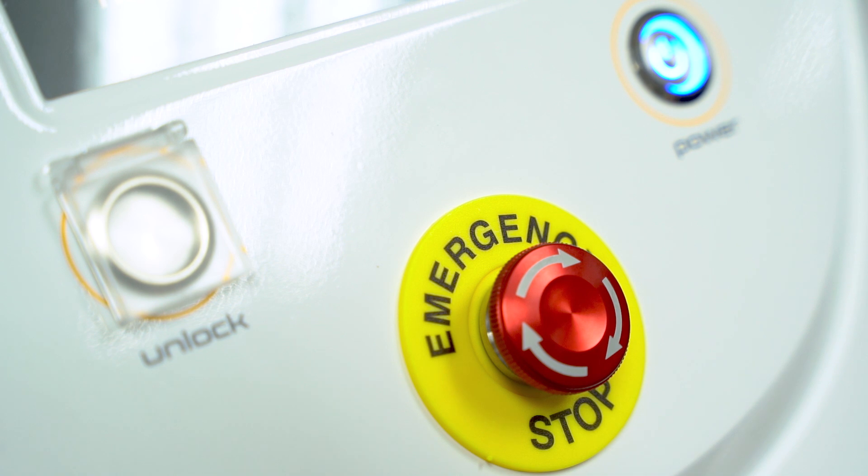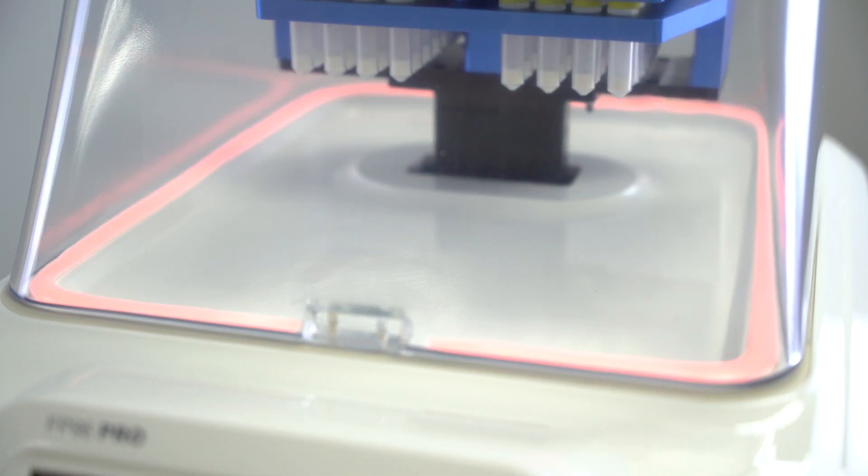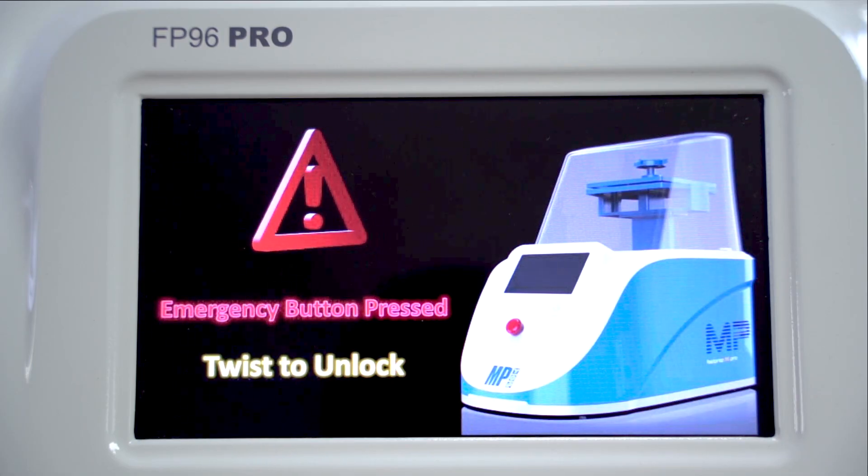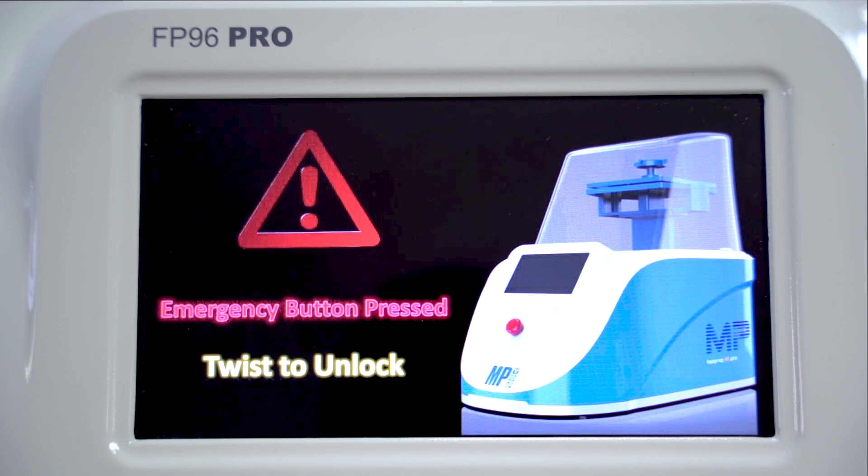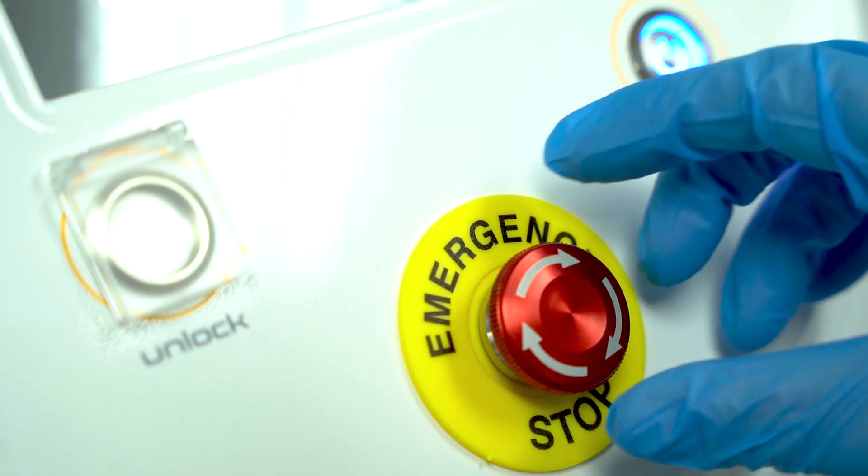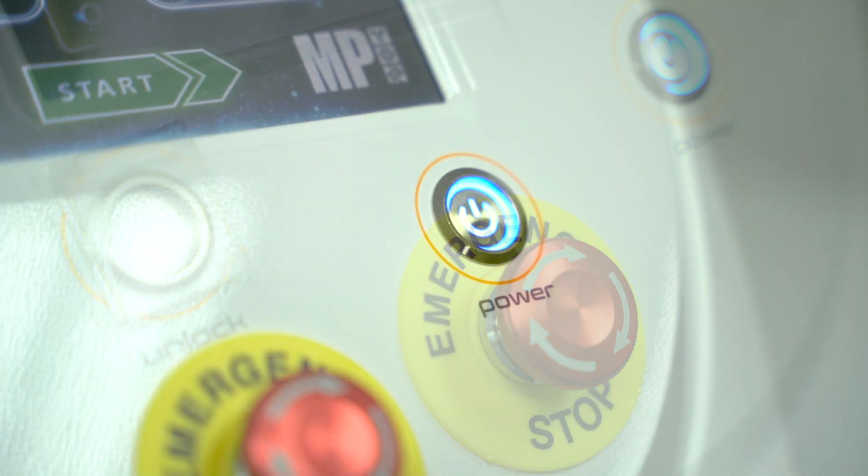This critical feature is intended to prevent accidents, injuries, or damage to the equipment. An emergency pop-up screen will appear. To reset the machine, simply twist the knob clockwise.